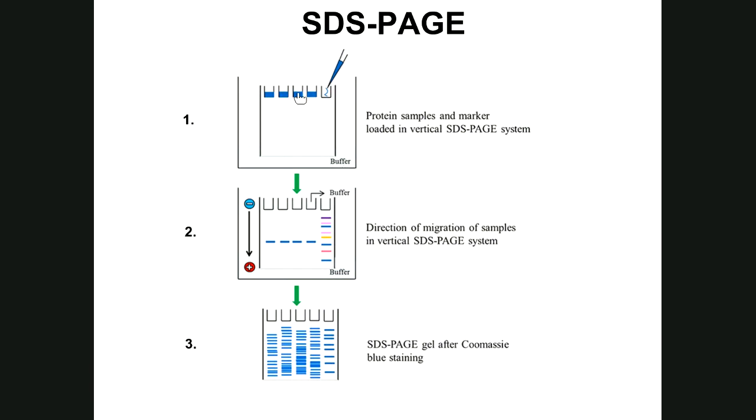Then once you have your protein samples loaded into their wells, you would begin the electrophoresis process. All your proteins are coated in a net negative charge. Therefore, the cathode emits a negative charge. It pushes your protein samples into the gel. The anode emits a positive charge. It's pulling your proteins through the gel. But initially what you see is just the tracking dye in each of your protein samples as you're visually watching this. Now the protein marker here is pre-stained, so you would see that.